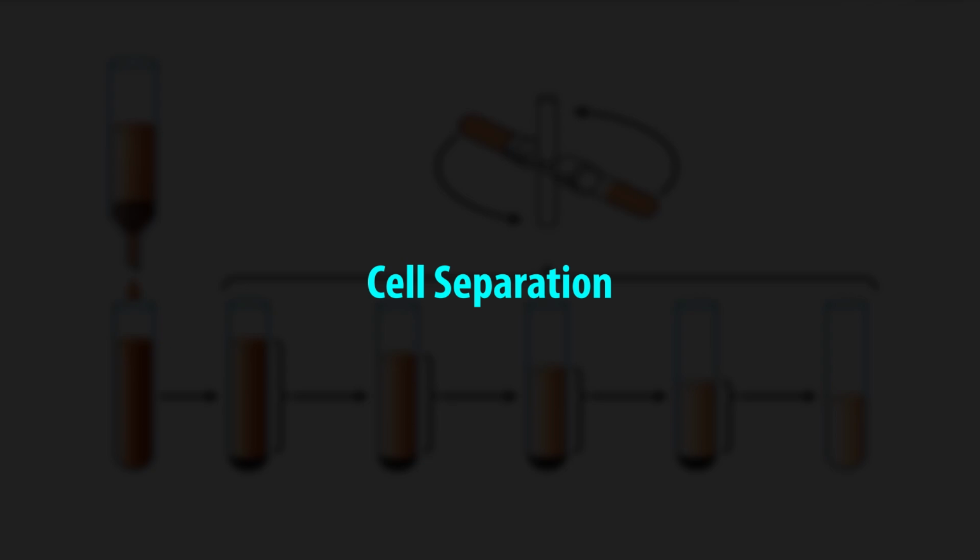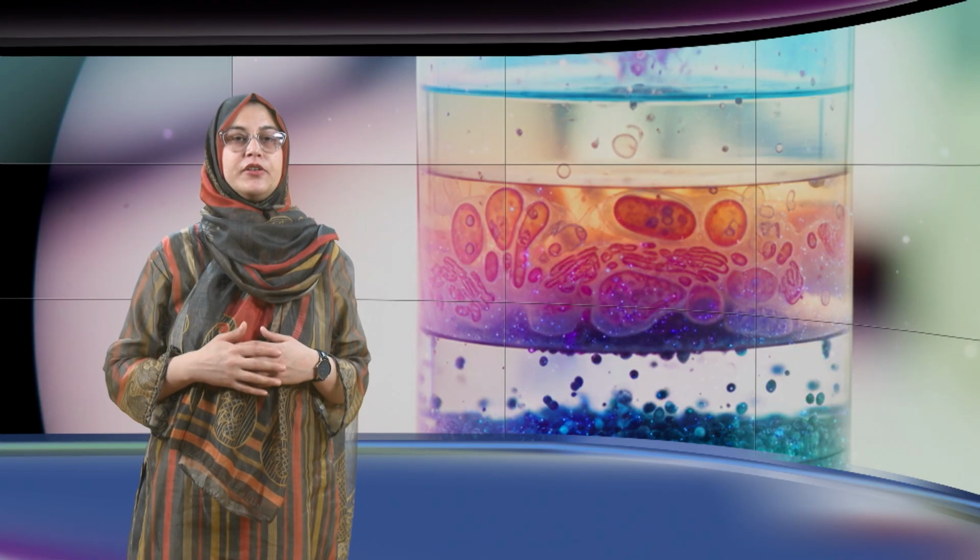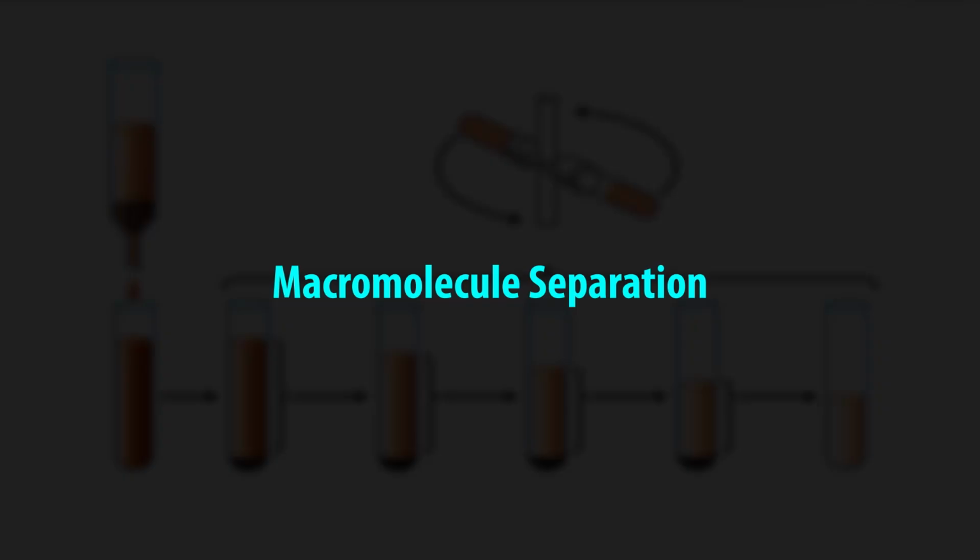virology studies. Cell separation: Ficoll-Paque gradients isolate PBMCs for immunology research, separating lymphocytes from denser erythrocytes.